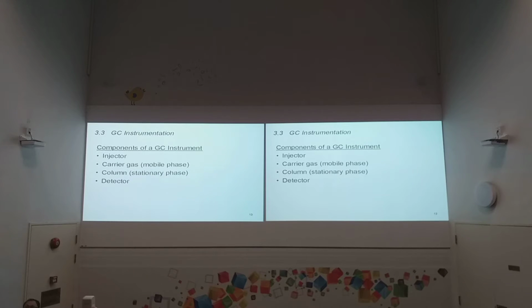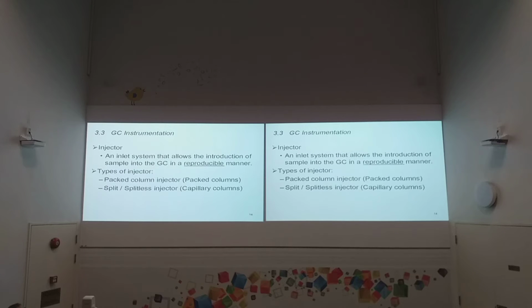But one of the key things you should remember, right? The injector actually is a device that allows you to introduce the sample into the instrument in a reproducible manner. Right?